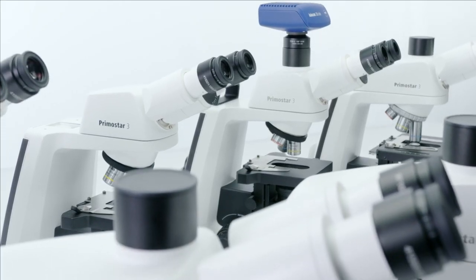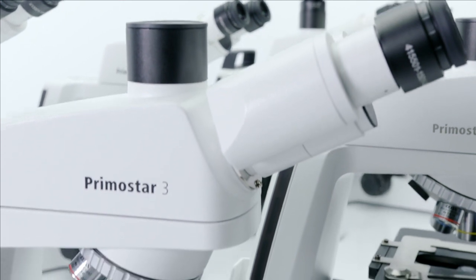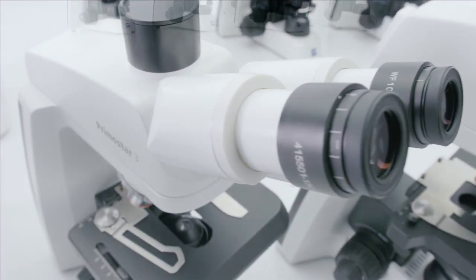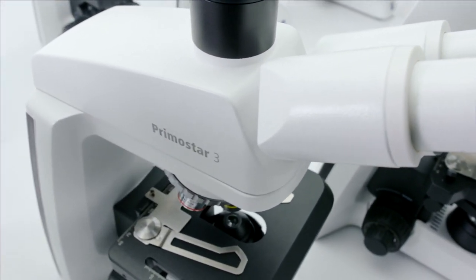With the Zeiss PrimoStar 3, you're free to work either with a 30-watt halogen bulb or with energy-saving LED illumination offering stable color temperature and illumination intensity.